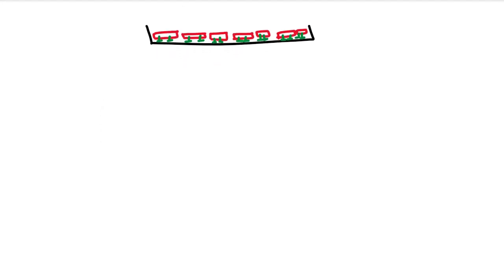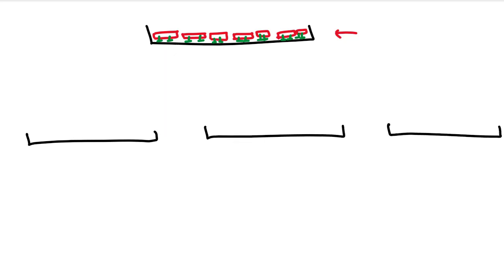You go ahead and you take these cells that are in this plate here, right? And you divide them into multiple other plates. So let's say we're going to divide them into 3 plates. And I think I can fit it into here and keep the size somewhat similar of the plates, right? And what will happen is that now these cells are on the bottom of the plate and they have a little bit more room. You went from 100% to maybe, actually let me take one away, to about 30%, right, on each. Now this action is called splitting.